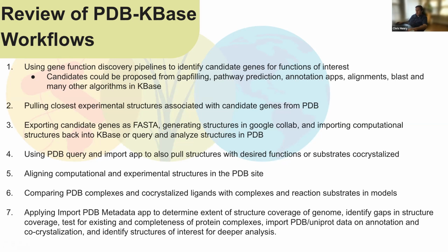And of course you can apply the import apps to look at structure coverage of a genome. And I'll show you how to do that in a second. Identify gaps in the structure coverage, which is important as well. Test for existence and completeness of protein complexes. I'll show you how to do that. And then import PDB and UniProt data into the annotation of the genome.